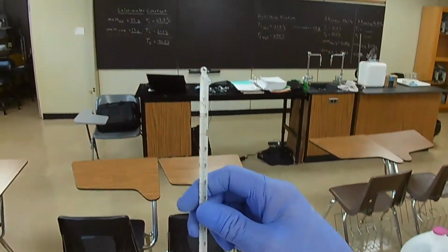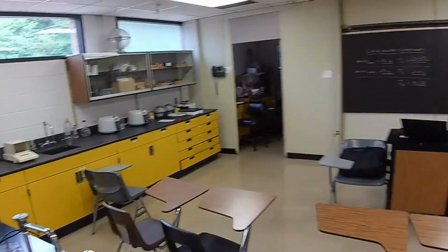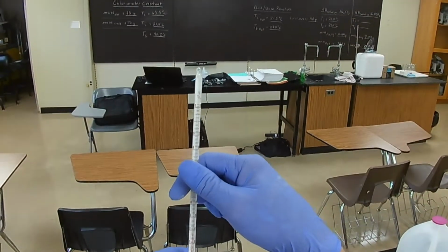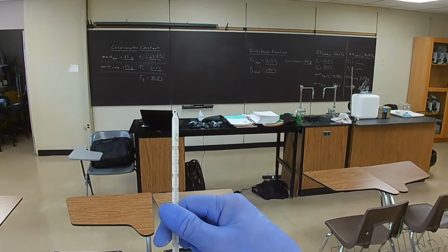Yep, I think we reached bottom. Yep, a little bit lower. Let's give it another whirl. It's below 17. We're going to have to estimate that last one. Looks like 16.8.